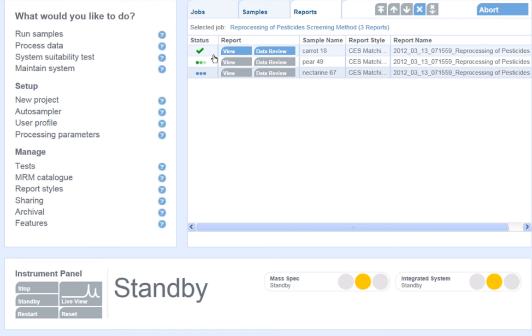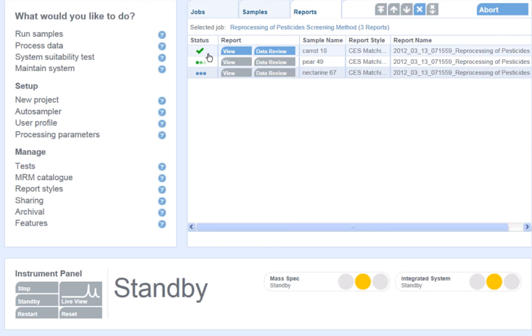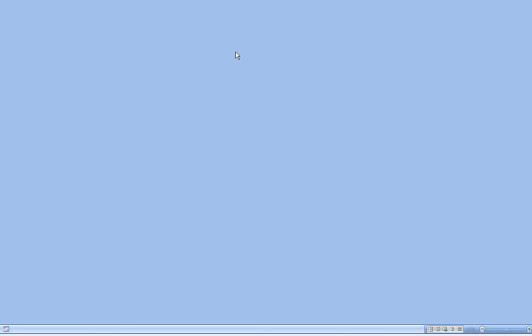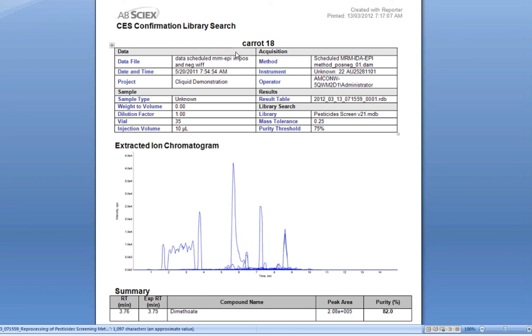Since I selected a per sample report, the report generation will be for each individual sample. Once a report has been processed, the three dots will turn into a checkmark to the left of the sample name, and I can open up that report and view the output.